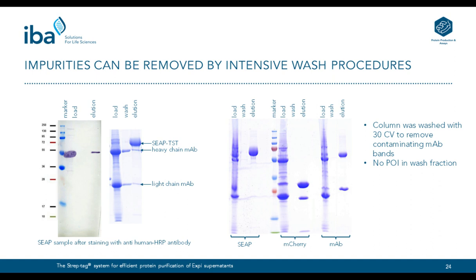because it gives you the possibility to do these intensive wash procedures. Furthermore, you can imagine that you might have proteins that bind to the column that you have to wash away by adding some detergents, or others by salt concentration. So it gives you also the possibility to wash with different wash buffers without getting in danger of losing your protein, to achieve high purities, even for very challenging purification tasks.